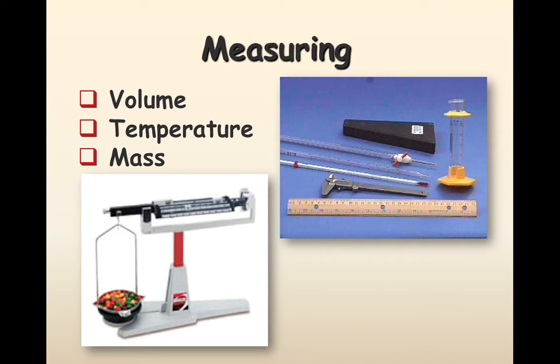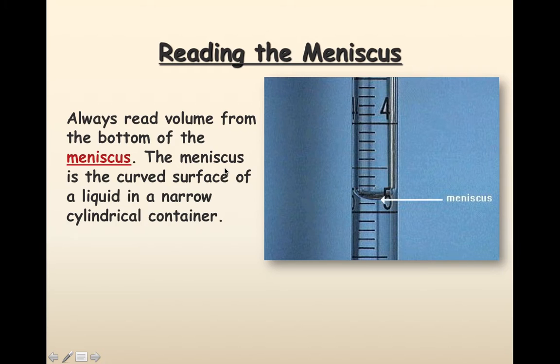Good day. As we recap, we're looking at measurement, and you can see it's saying measuring volume, temperature, and mass. This is the old way we'd measure mass. We still have some of these scales around, but of course now we typically use an electronic balance.